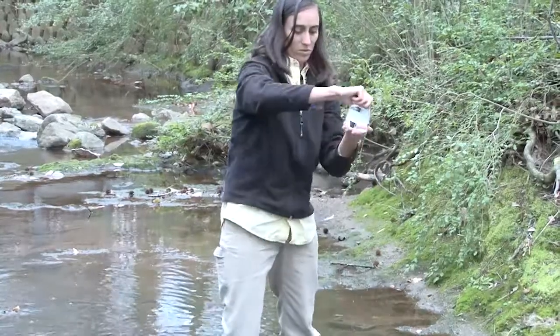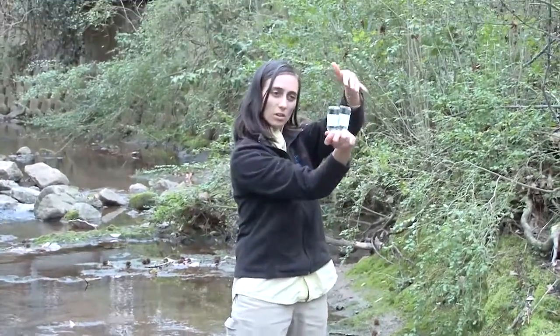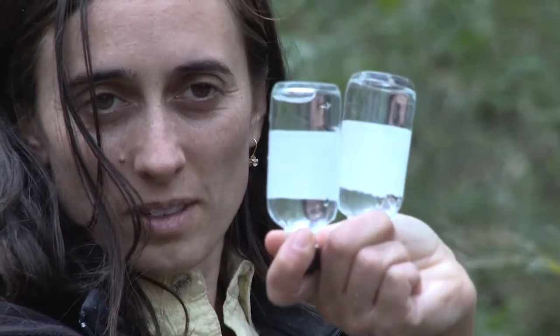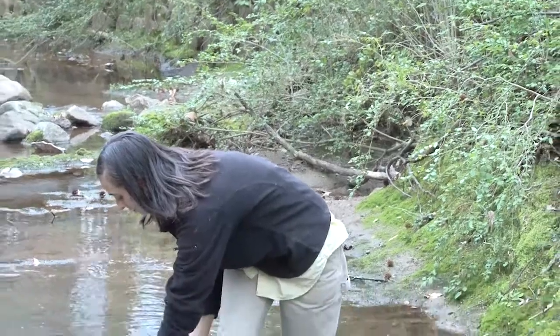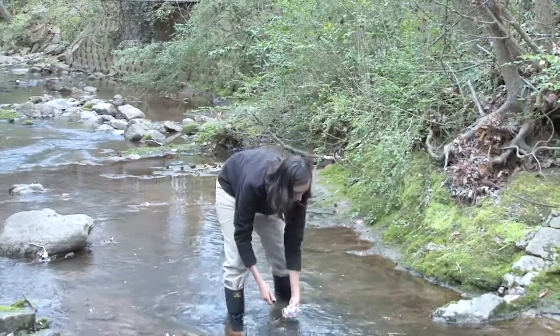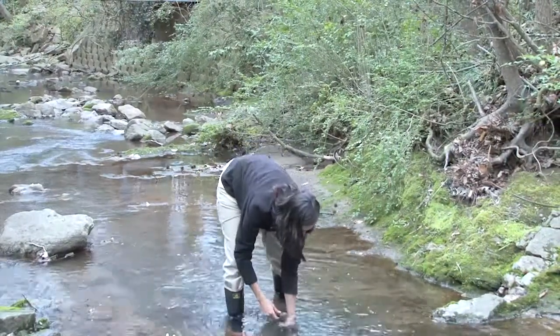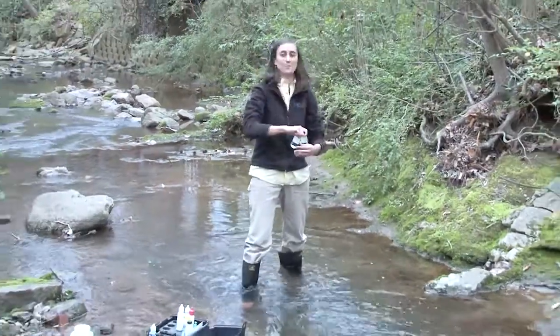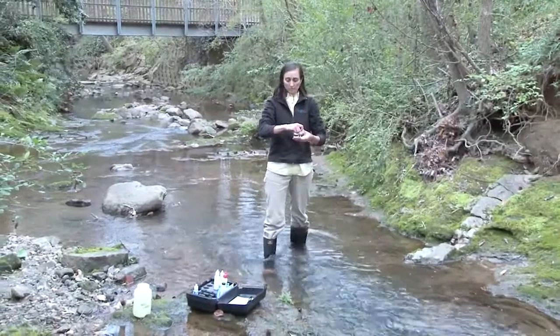Now that she has the water, she's going to turn both bottles upside down to check. She has an air bubble, so she has to dump the water in both bottles and recollect the samples. She's pulled new samples, and this time, no air bubbles.